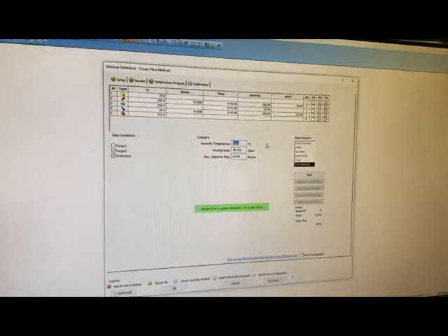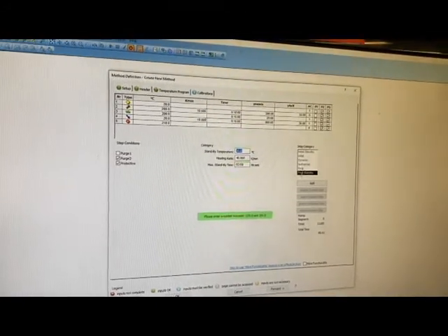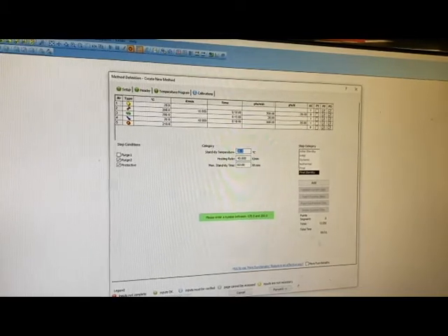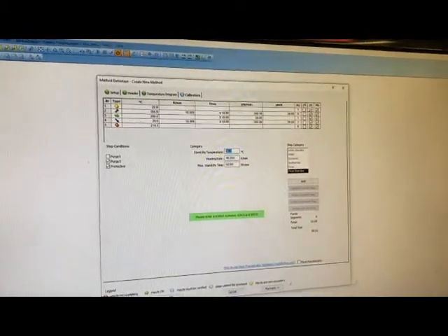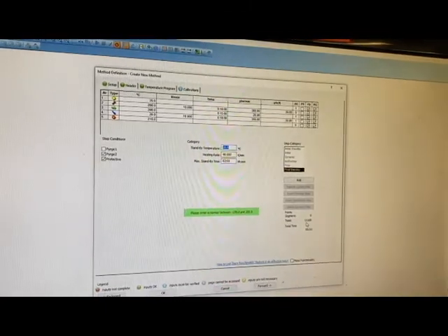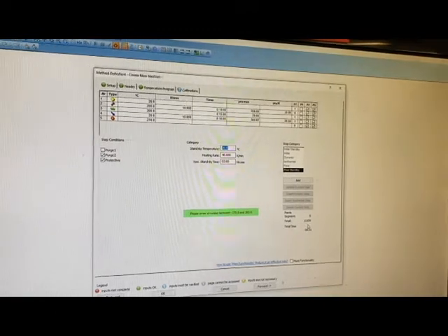Once you've added that final step, you can see in the corner the total time — this is a roughly 50-minute scan — and we're going to get about 11,000 data points. The scan will heat up to 200, hold for 15 minutes, and cool back down.